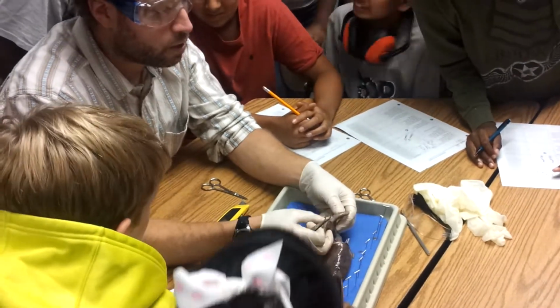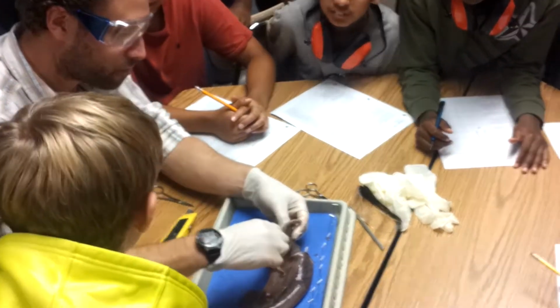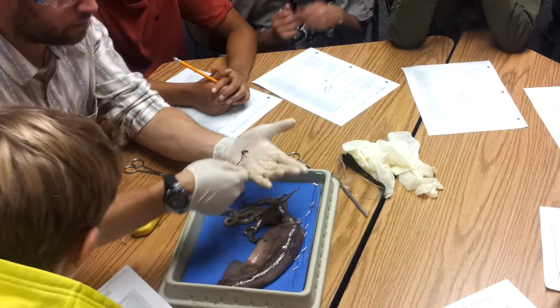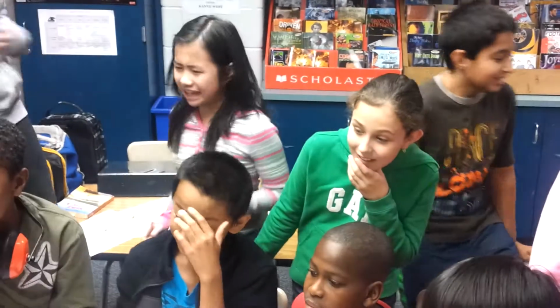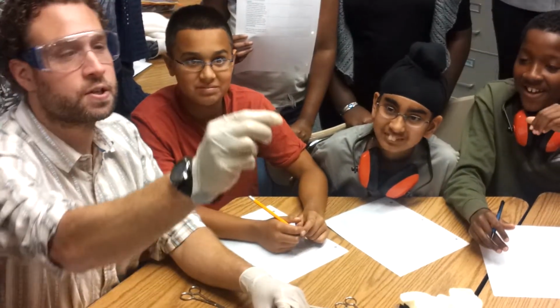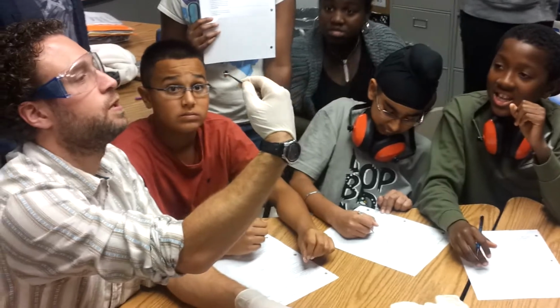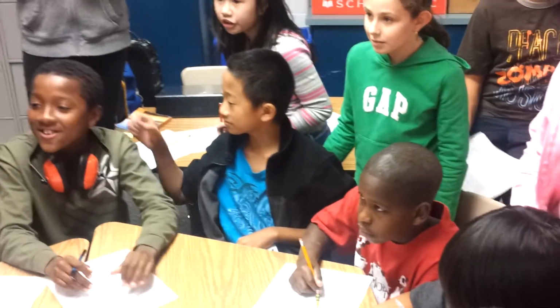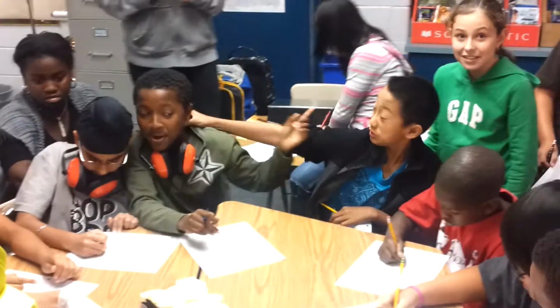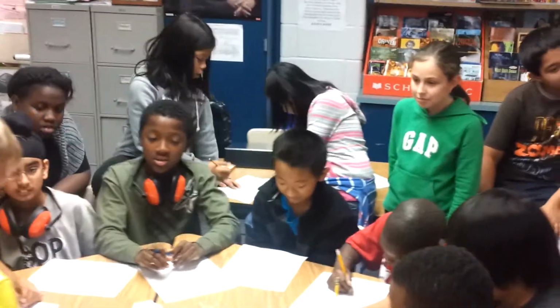So in the middle of the tentacles is a beak. That black thing. That's disgusting. Can you hold them up in the air so all the parents can see? So there's the beak. I'm not going to have everybody touch everything because then it will be very dirty. The rest of the squid is soft, but this is nice and hard. It's a beak, like a bird would have. There's an upper and a lower.